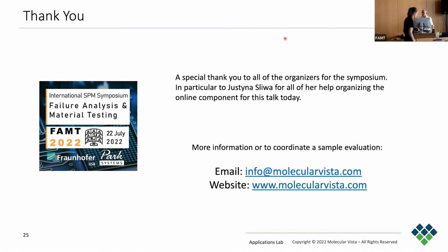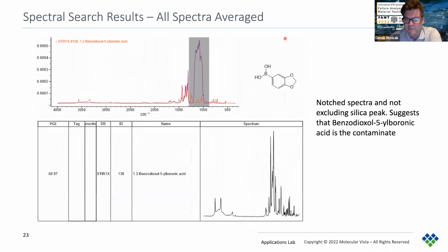If you're looking at the distribution of chemical maps, do you use peak height or peak area for showing the distribution map? So I'm sorry, just to ask that one more time. It was a little muffled, but basically, if you look at the distribution of chemical substances, you sit on a certain band, and to show the distribution, you could either use peak height at a certain position or use peak area.